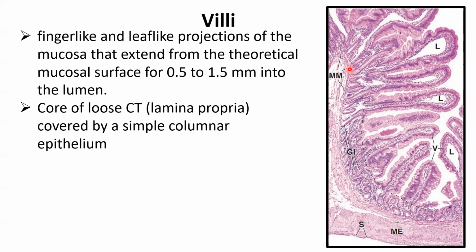Now here you can see in this image, if you look at this, we assume this is the surface epithelium. You can say it's making these projections up. So we call this villi, finger-like projections. From the surface of the epithelium, they go up. This is a connective tissue core from the lamina propria, and then it's covered, making these finger-like projections, similar to the lingual papillae.